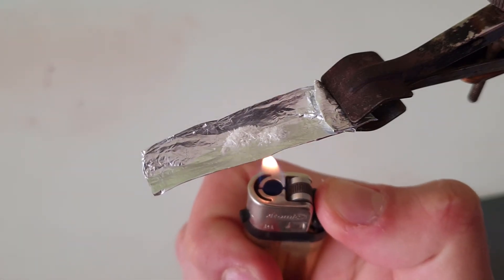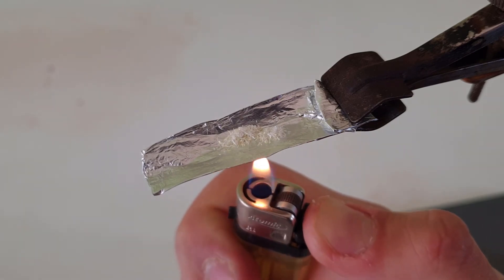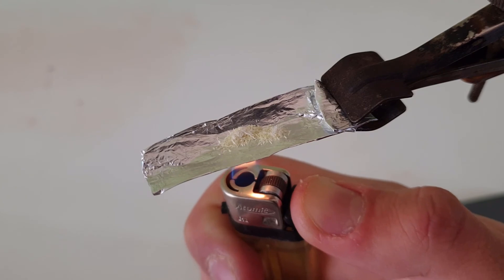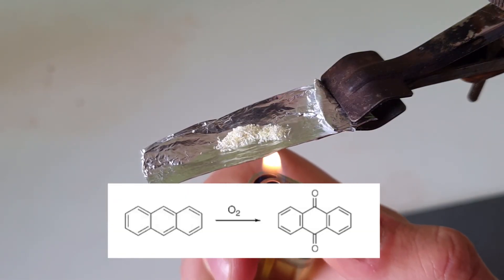The dimer also decomposes at its melting point at about 265 to 275 degrees Celsius, theoretically forming anthracene. But in air, it of course oxidizes to anthroquinone, which tinges the powder slightly yellow.